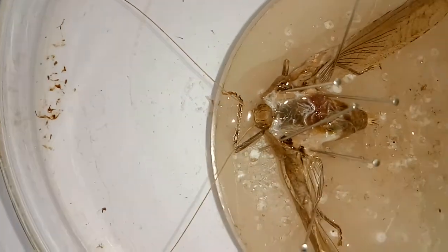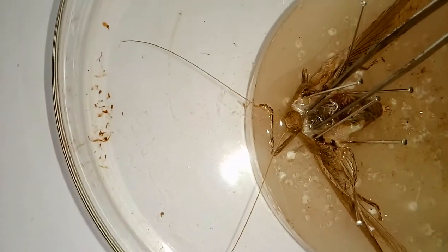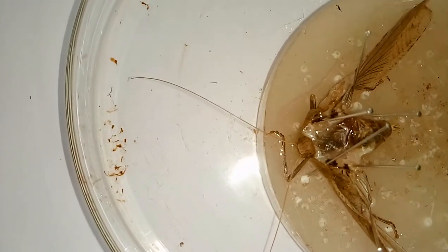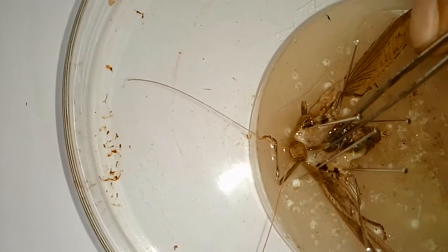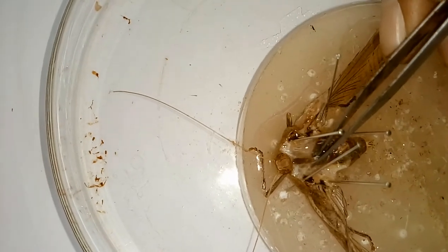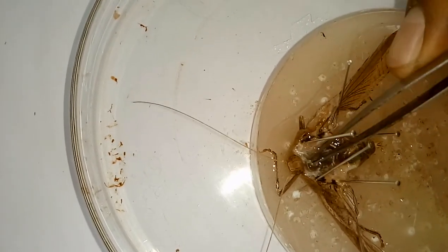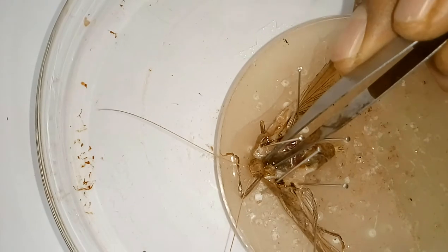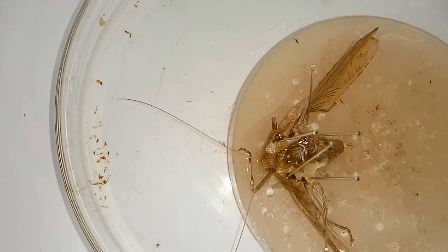Before removing the gut of the grasshopper, we have to look at the neck region. From here, pick this black structure — this is the gut. The first part is known as the crop or stomach of the insect. Here, this small thin tube-like structure, clearly visible, is known as the esophagus, which lies along with the mouth cavity. Just remove it from this portion using your forceps carefully.